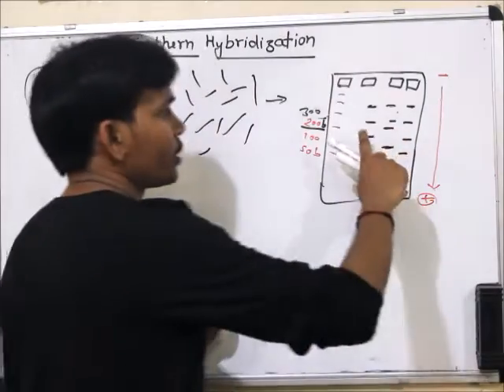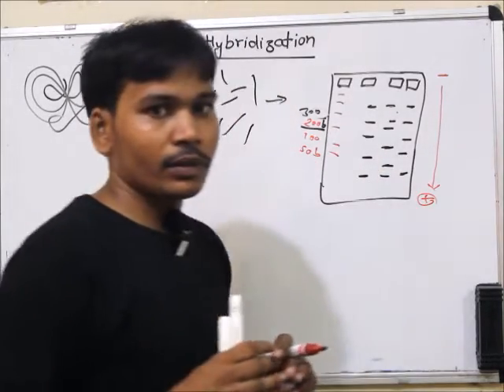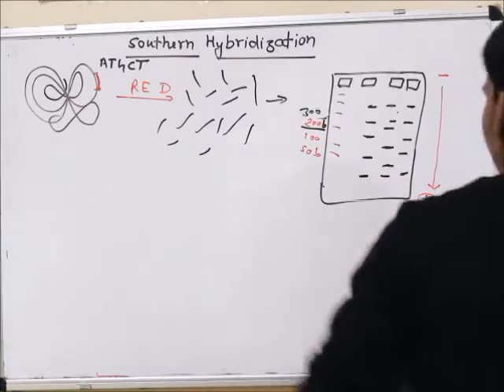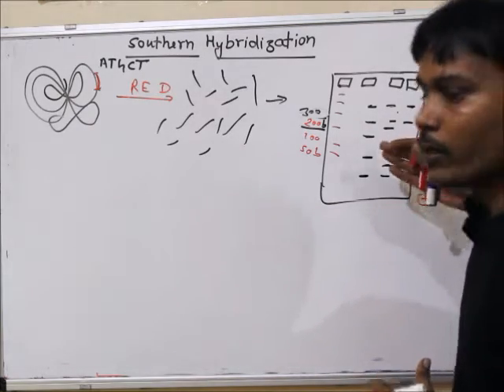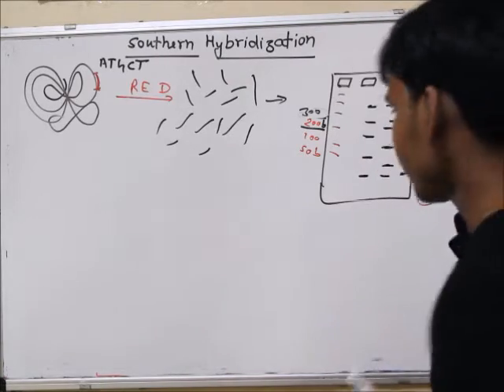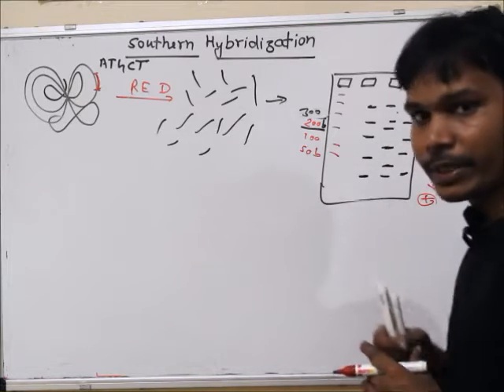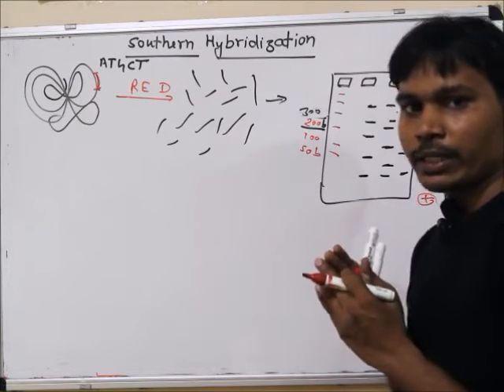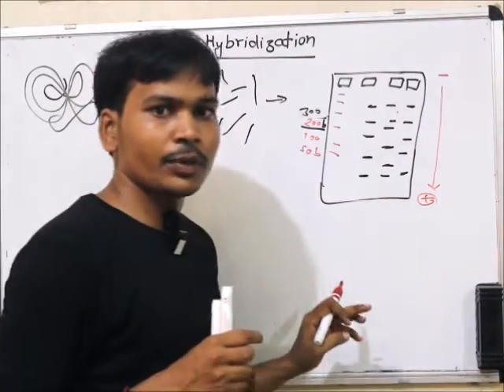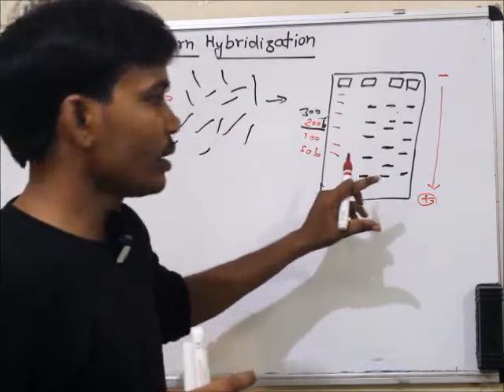This looks slightly similar, or maybe similar, in the gel, by the naked eye, by the UV films. You know that we cannot see DNA with the naked eye. We need ethidium bromide mixed within the gels, and the ethidium bromide fluoresces in the presence of UV where it occurs in the DNA, so it can be detected. There is close similarity, but we cannot say that this is the exact sequence in this gel. This is the problem with the gel.